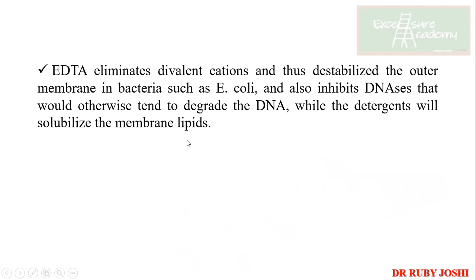Now, we know EDTA is actually your cation chelator, right? So it can destabilize the outer membrane of the bacteria. We know the calcium is required over there, so it can chelate the divalent cations from there and then start helping in cell lysis. Okay.